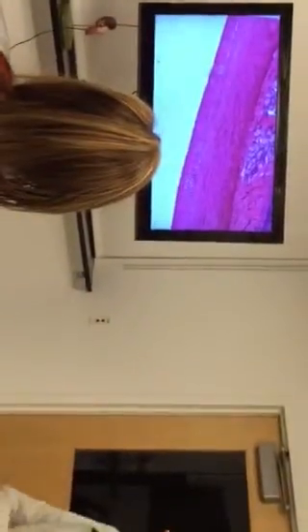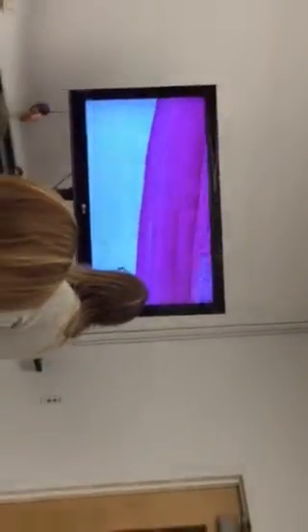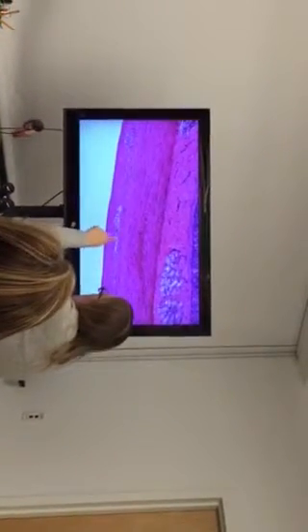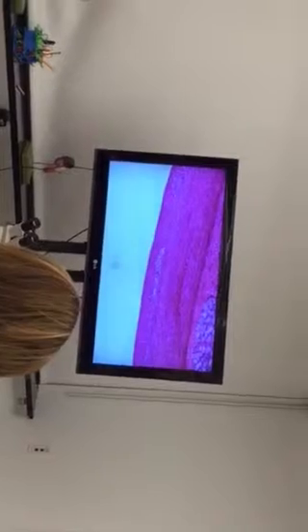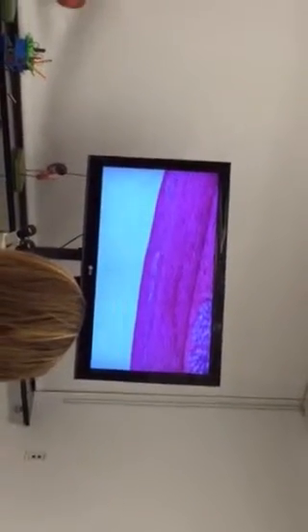That bottom layer isn't the second layer of muscularis externa? It runs together here, so I'll show you. What did you say was the serosa? Serosa. Because I thought that was muscle. This area right here is one layer of muscle. Yeah. There's another layer of muscle, but it runs into the serosa. So I will point to the outermost area for serosa. Outermost area. Okay. Yes, it won't be near the muscle. Because depending on the slice, they kind of run together there. Sometimes the serosa picks up a little bit more stain too, so it looks like muscle. So I'll point to the outermost, nearest the white space, right? Not the villi, but the other.